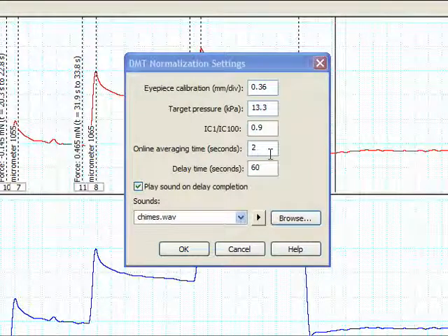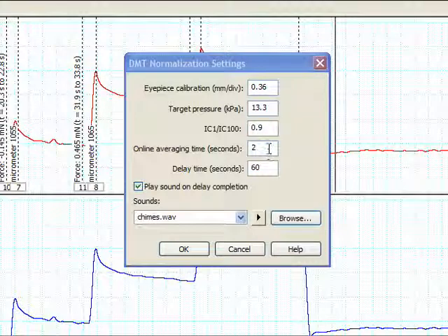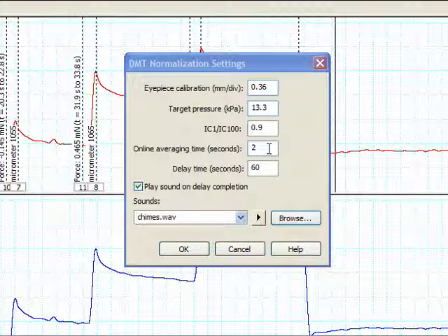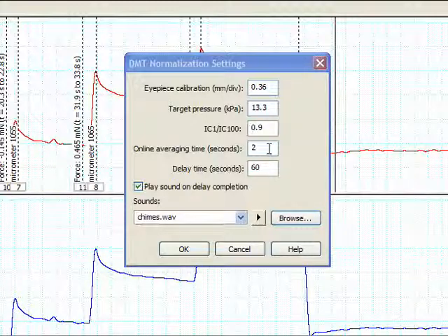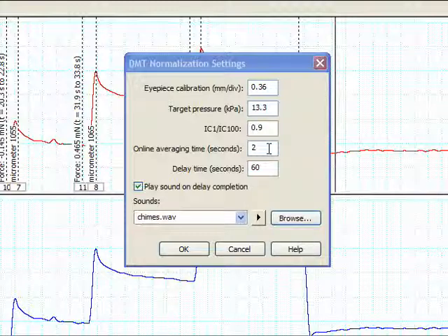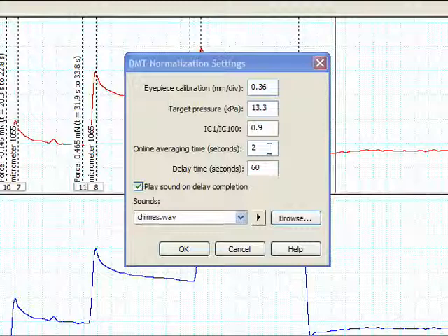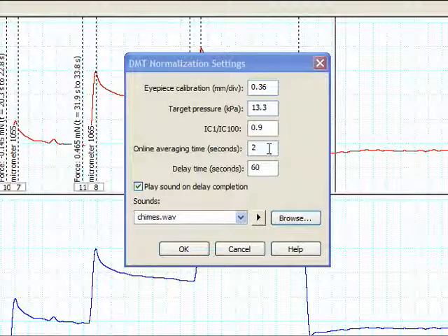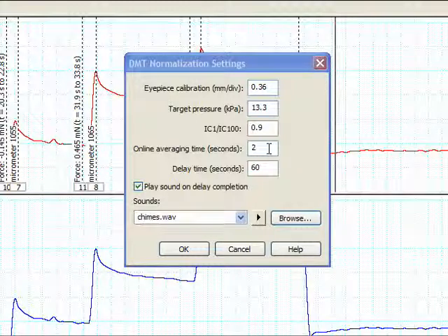The next parameter in the settings menu is the online averaging time. If you perform the normalization procedure online, the force reading corresponding to a micrometer setting is determined by averaging data from the online average time period. This is the period of time immediately prior to the point at which the delay time ends. If the delay time is zero, then the online average time period is effectively immediately after the point at which you click add point.